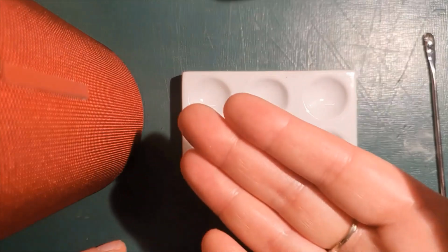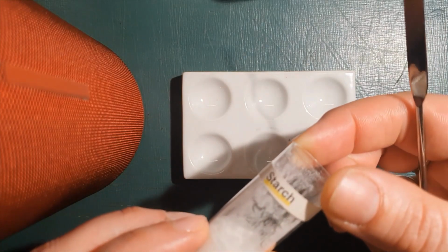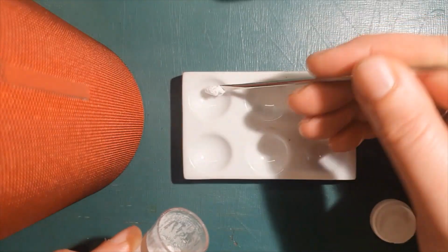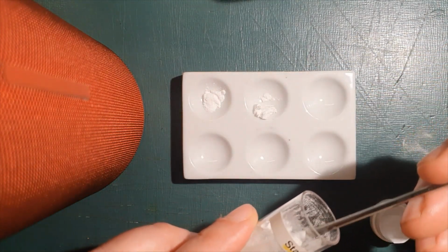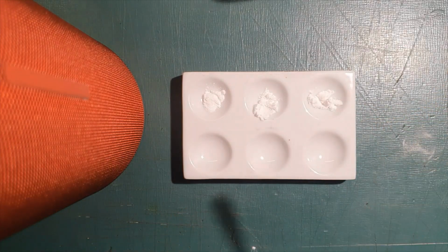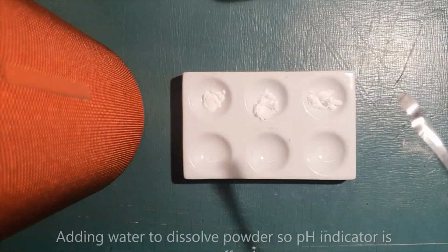Alrighty, so we have our well plate. First powder we're testing is starch. So I'm going to put some starch in each well. Great. Make sure we're looking at starch.